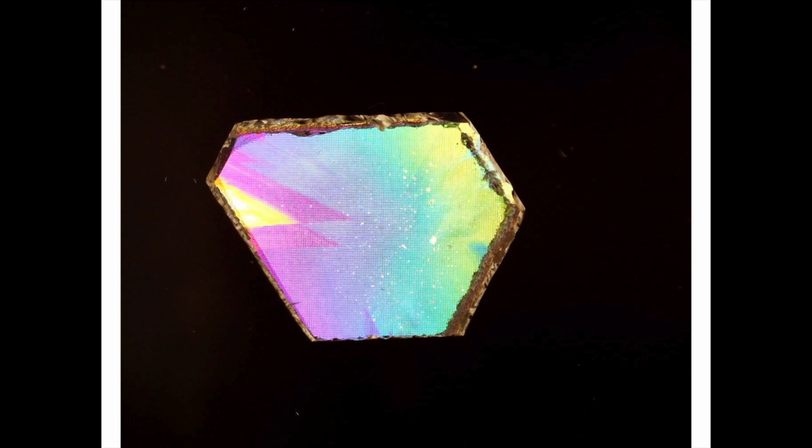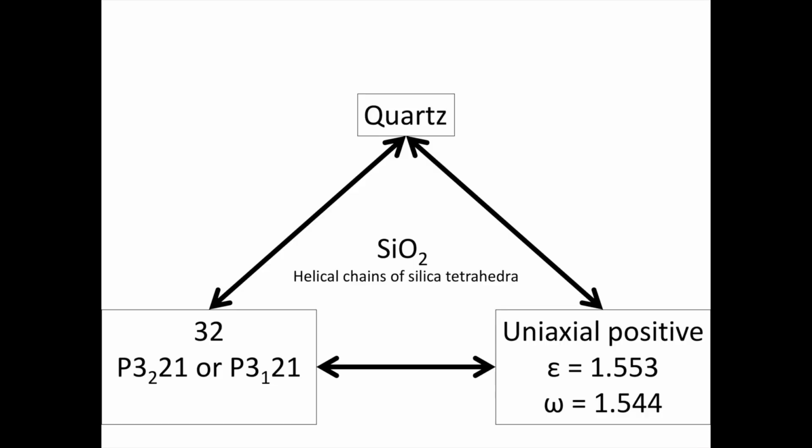So I think that's sufficient for our dive into the optical activity of quartz, but now let's focus on another phenomenon that's going on with our quartz slice here. So I want you to notice these triangles highlighted in the red oval. You can notice a couple other small ones around the edge of the crystal as well. And these are actually Brazil law twins in our quartz crystal. So our viewing setup of looking at our quartz slice with crossed polarizers is a great way to observe this twinning. And the reason we can see this twinning takes us back to the structure of quartz.